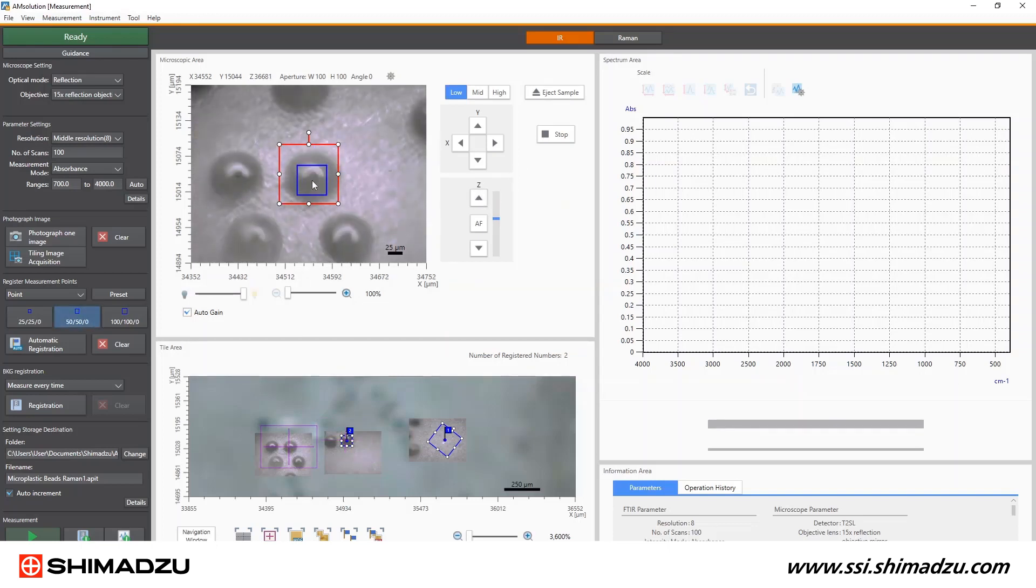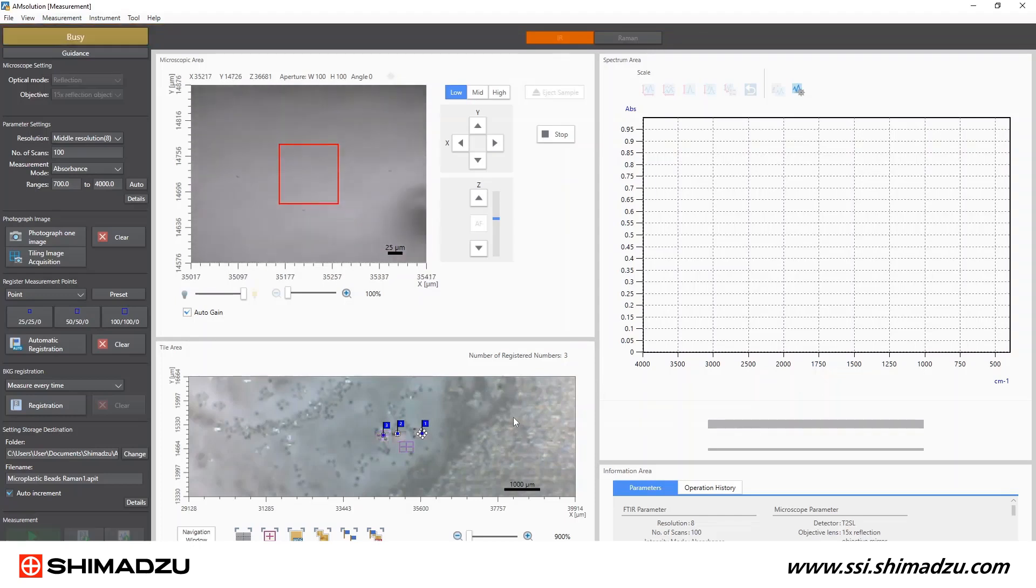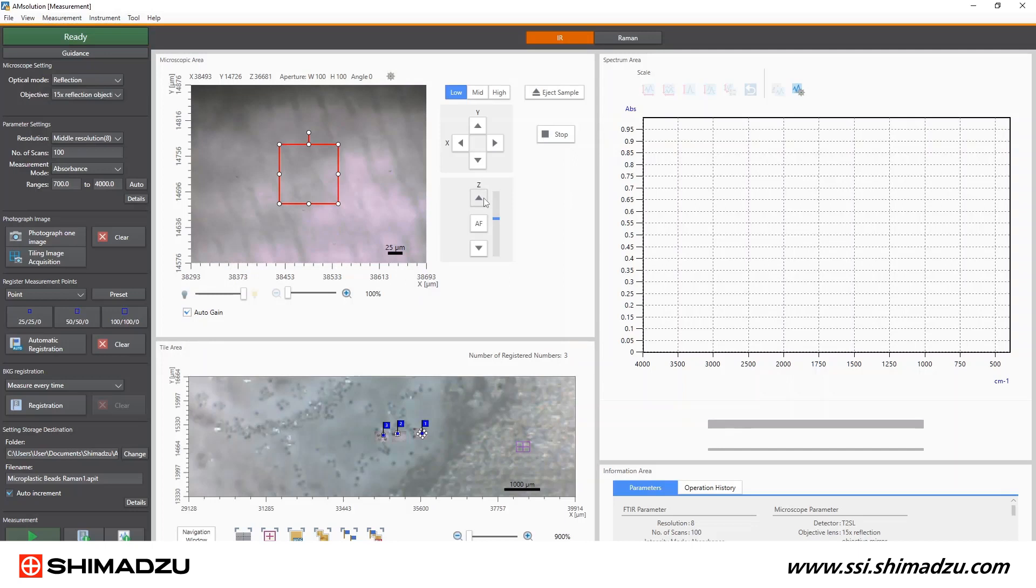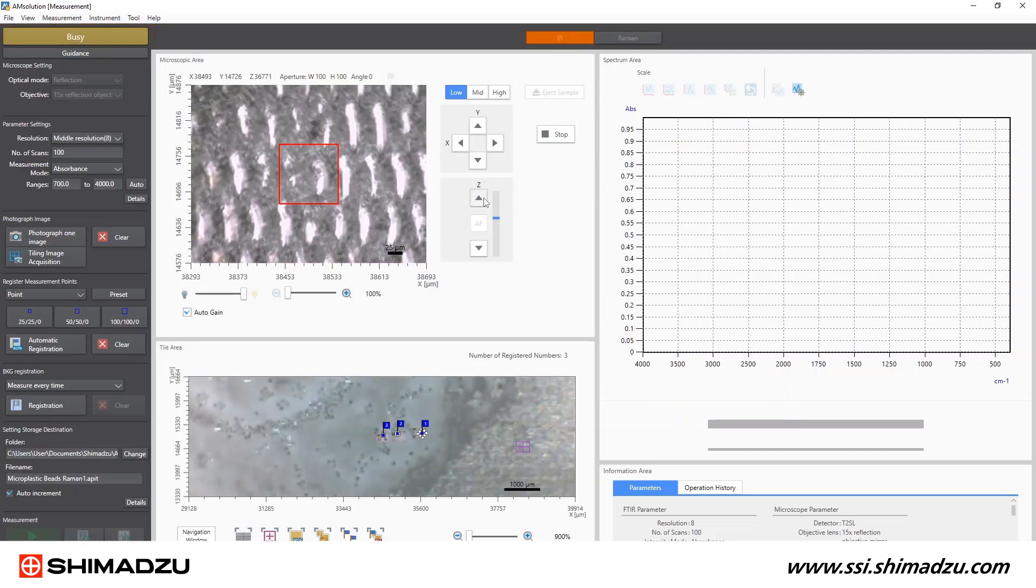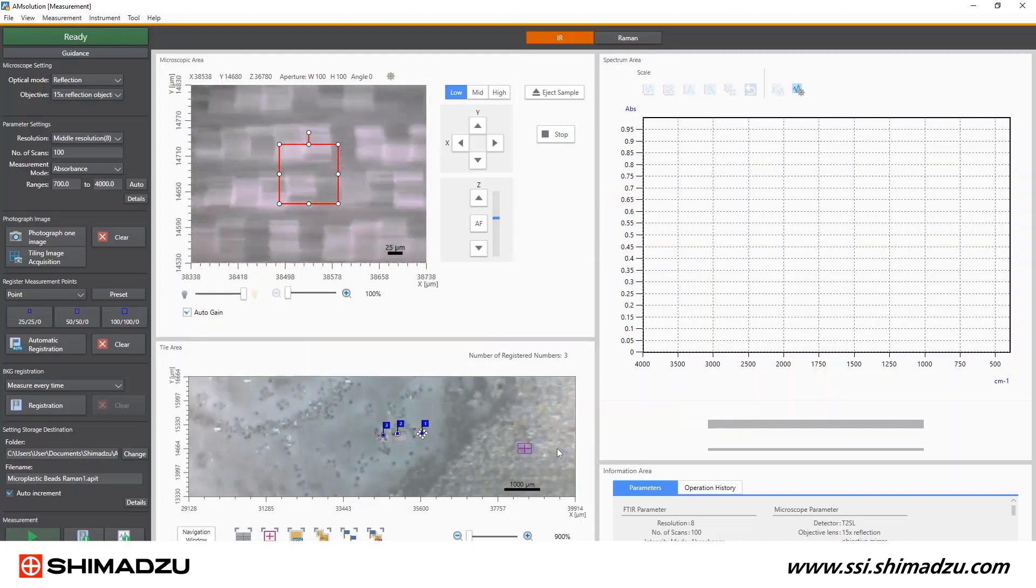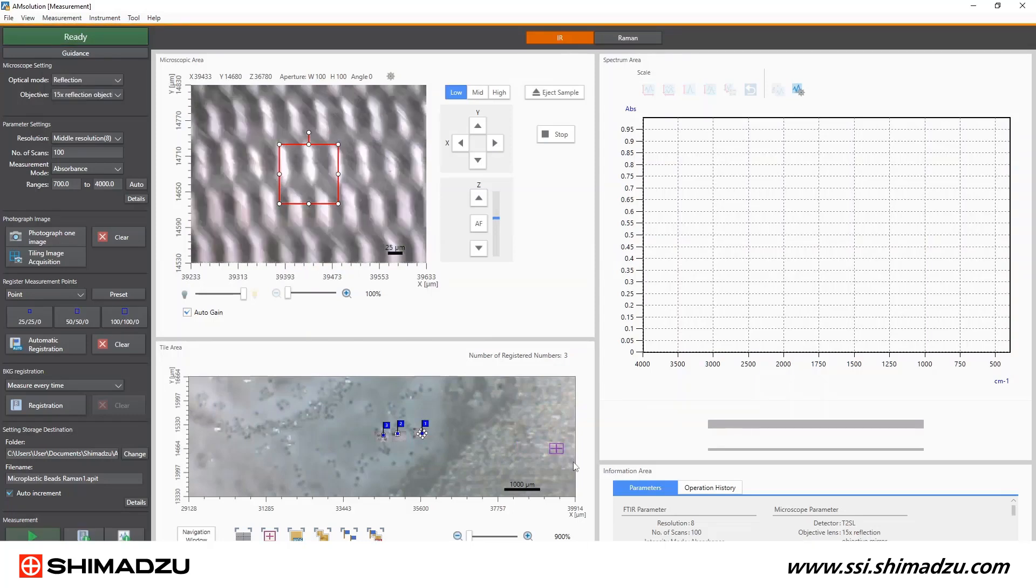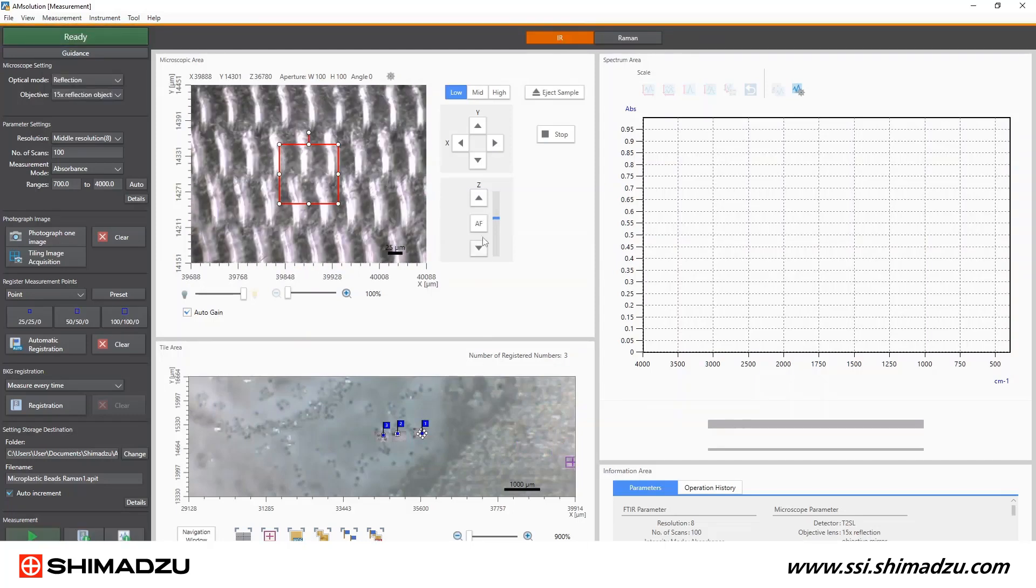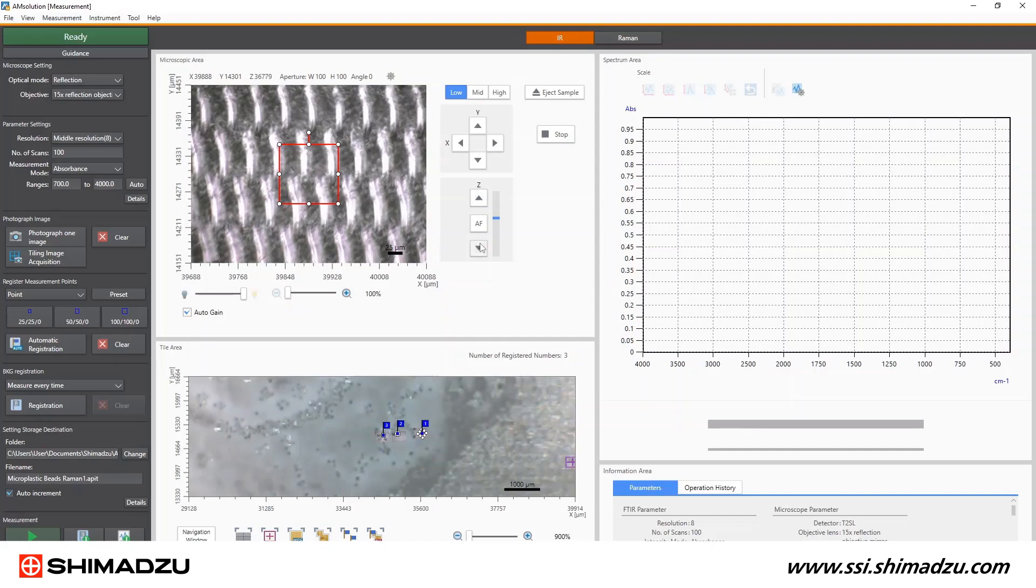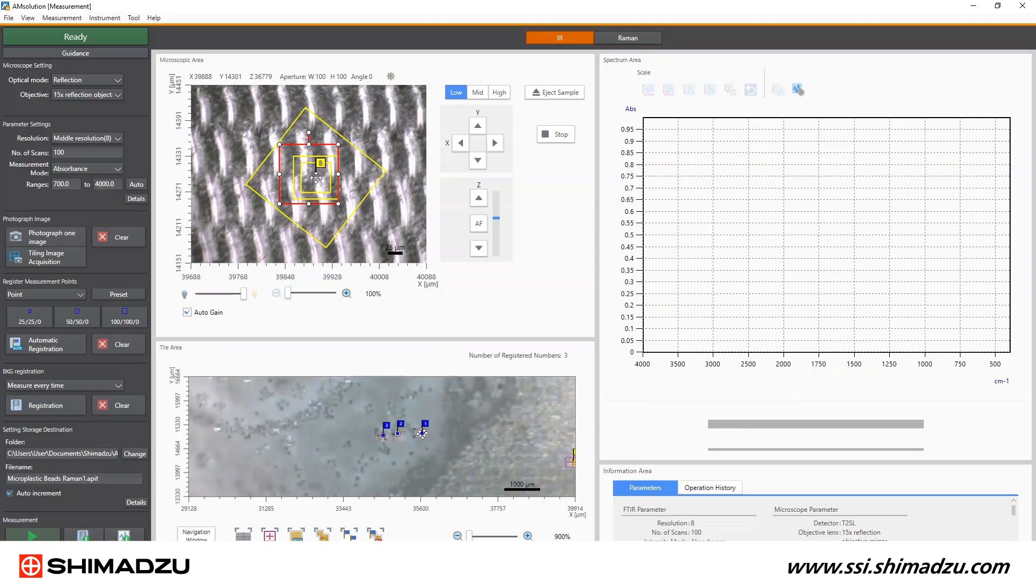Now that we registered our sampling locations, it is time to register our background location. I'm going to scan away from the microplastics and pick a clean part of the filter. The Z-height focus needs a little touching up because the filter is below the microplastics. Since the aperture sizes and orientations of the sample measurements are all different, I need to measure the background every time with a corresponding background aperture. Lucky for us, AM solution software knows that. And when I click registration and drop the background flag on the image, it automatically creates a matching background aperture for each sample measurement aperture.